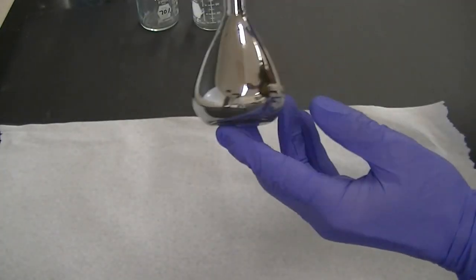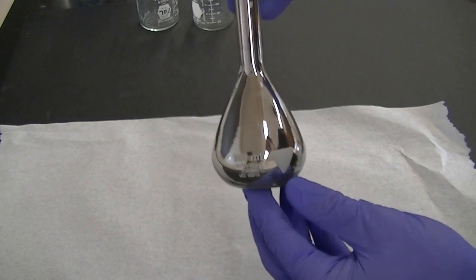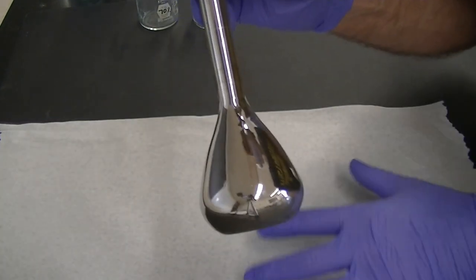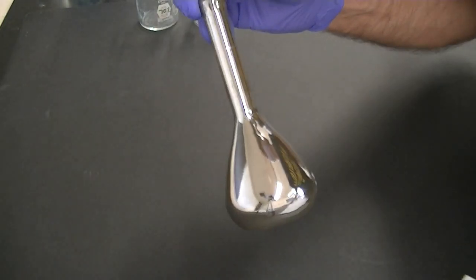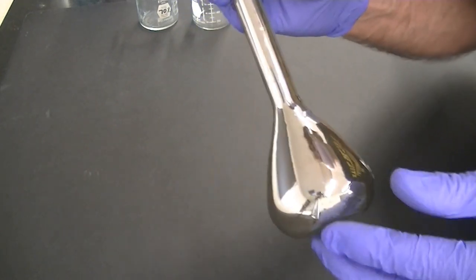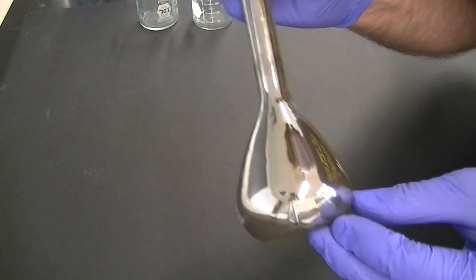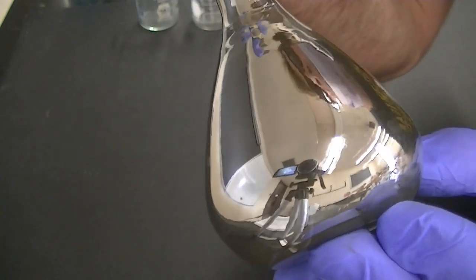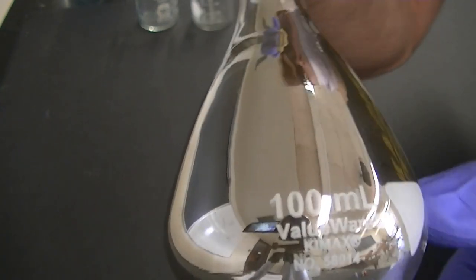Would you look at that! The experiment worked! The sugars in the Powerade were able to convert the silver ions into silver metal. This experiment was really fun to try out. Hey look! The mirror is shiny enough that I can see my video camera in the reflection!